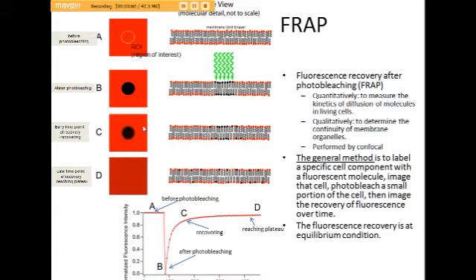By the way, we have to take note that except for the fluorescence property, these molecules are non-fluorescent, these molecules are fluorescent, but the two populations of molecules have exactly the same physical and chemical property, except one is fluorescent, the other one is non-fluorescent. So they diffuse and eventually will reach equilibrium. So it's homogeneous. Take note that because of the contribution of these photobleached molecules, once reaching new equilibrium, the fluorescence intensity is lower than before photobleaching.